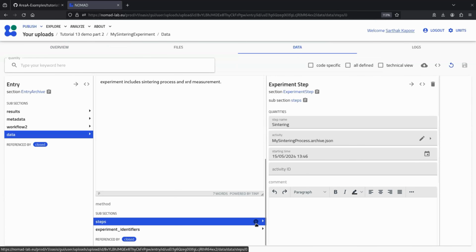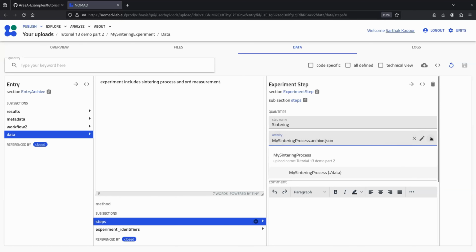So do you mean this little add button here? Yeah, I don't know. I was working on my screen and you were saying you click on add, and I could not see where you clicked, unfortunately. Okay. I'll try to be a bit slower then. So you just simply click on this add button, this is add. Okay, yeah, sure. No, I got it. All right. Thank you.